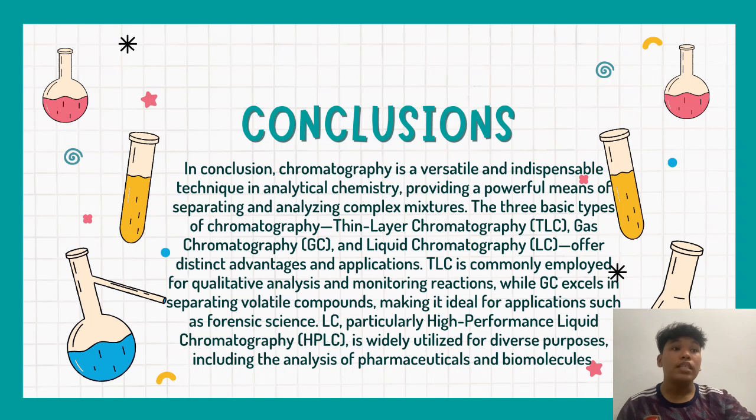TLC is commonly employed for qualitative analysis and monitoring reactions, while GC excels in separating volatile compounds, making it ideal for applications such as forensic science. LC, particularly high-performance liquid chromatography (HPLC), is widely utilized for diverse purposes, including the analysis of pharmaceuticals and biomolecules.